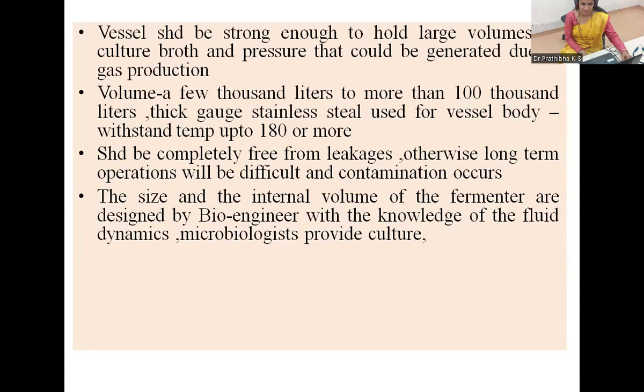The size and the internal volume of the fermenter are always designed with the knowledge of bioengineers, fluid dynamics specialists, and also microbiologists, who determine what amount of inoculum or culture broth is to be added, what kind of product is going to be produced, what pH level we need to adjust, and the temperature and aeration.